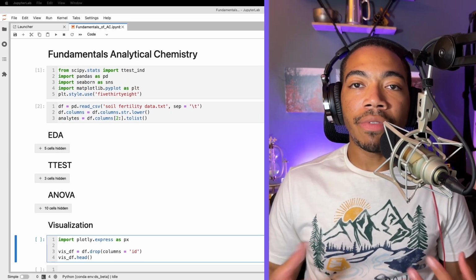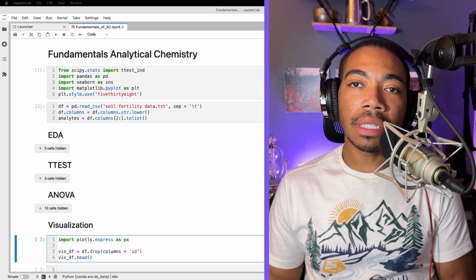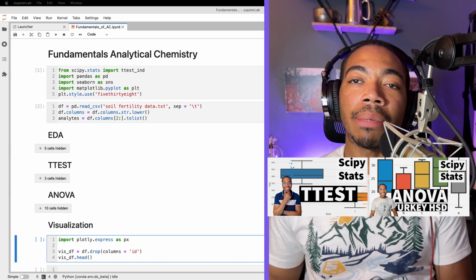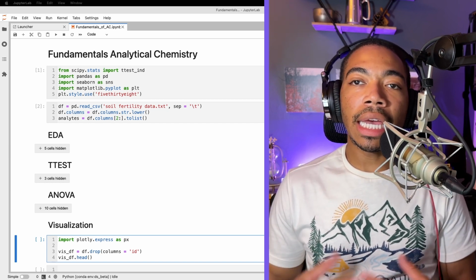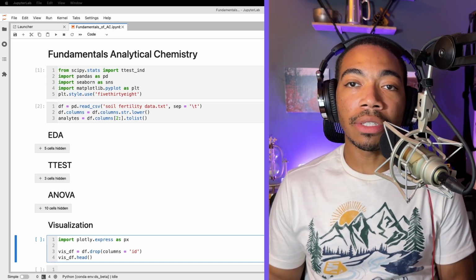In today's video, we're going to continue on our fundamentals of analytical chemistry video, where we focus now on the data visualization. Over the past few videos, we've done things like exploratory data analysis, hypothesis testing with t-test and ANOVA, and now I want to show how we can take some of these same sorts of tools with Python and do some visualization of multidimensional data sets that don't require statistics.